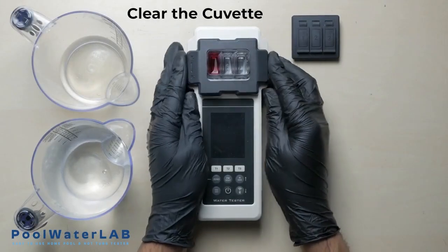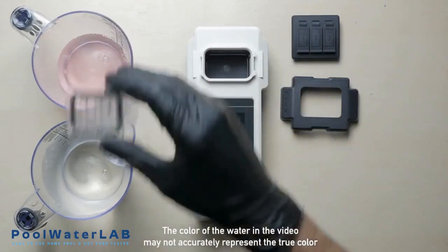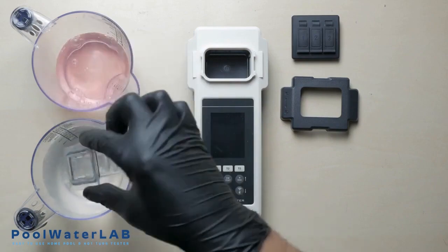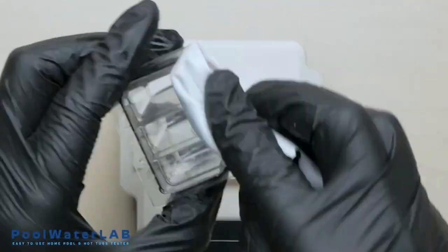After completing the test, obligatory rinse the cuvette with clean water and prepare your tester for the next measurement. Wipe dry the cuvette with a clean cloth.